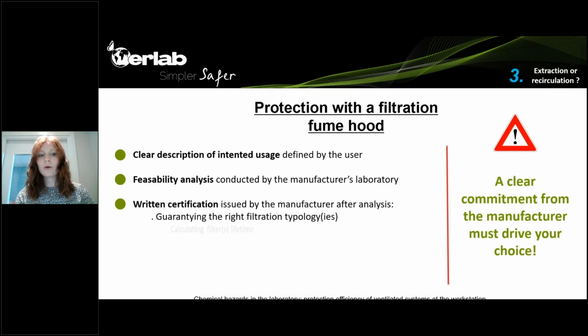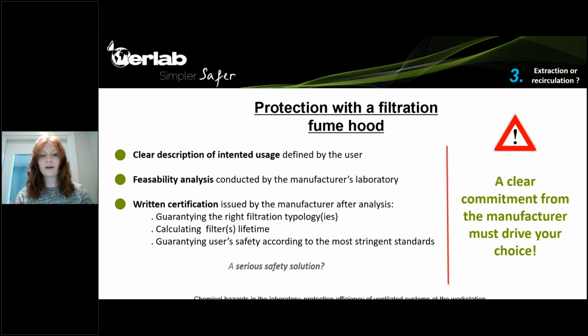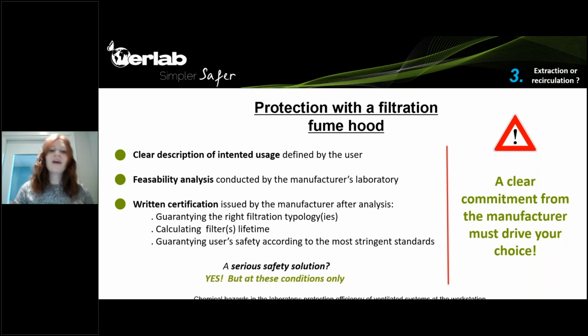So how would you make the choice? How can you decide if a ductless fume hood, a filtration fume hood, is a serious safety solution for you? Well, the answer is that it is a serious safety solution for you if all the conditions that we're going to see now are respected.